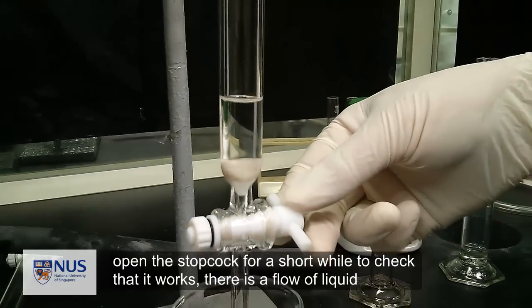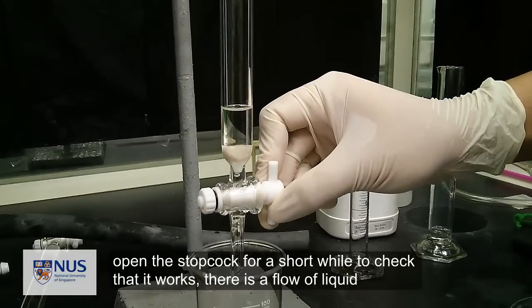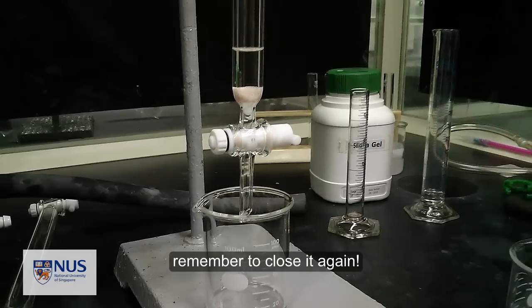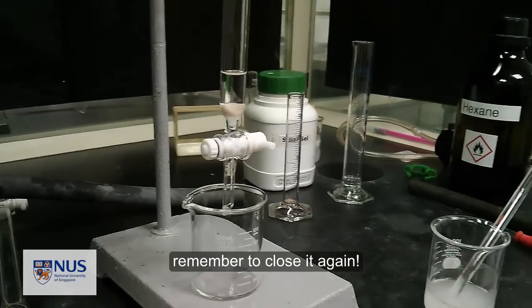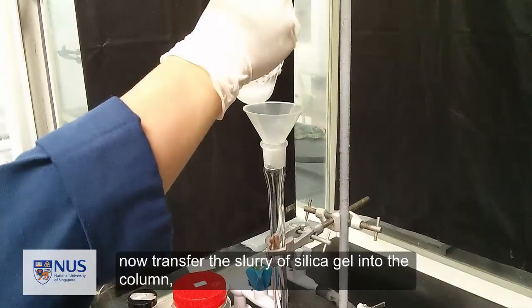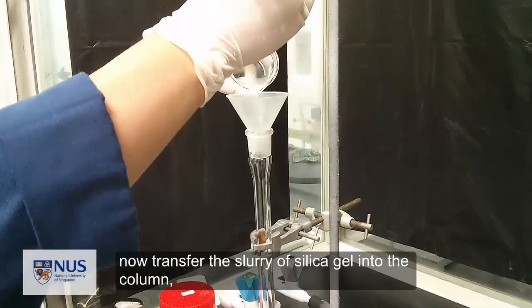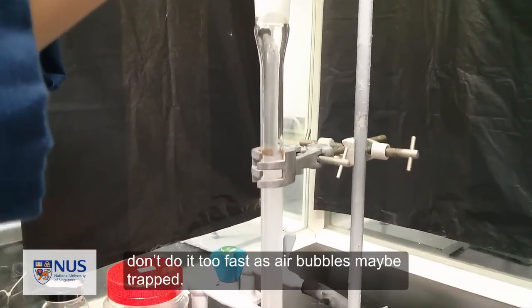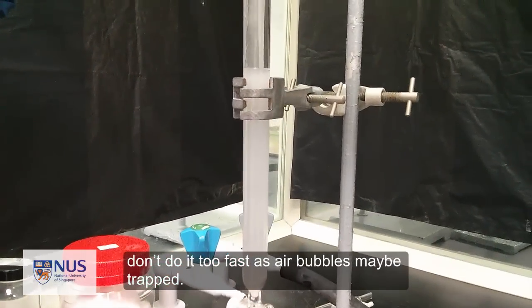Open the stopcock for a short while to check that it works. And then now transfer the slurry of silica gel into the column. Be calm and stoic. Don't do it too fast as air bubbles may be trapped.